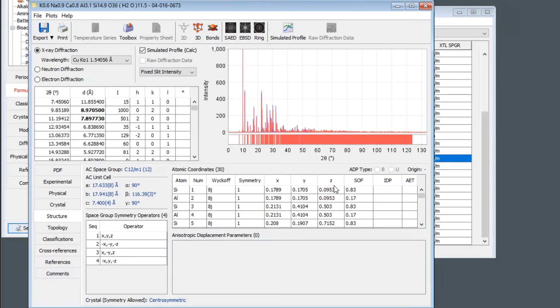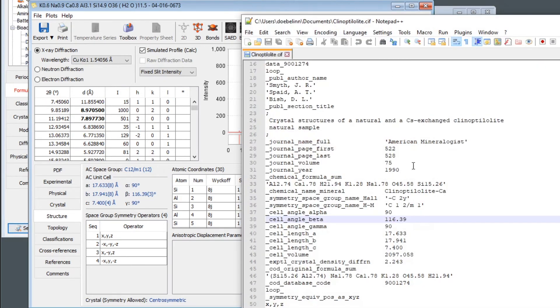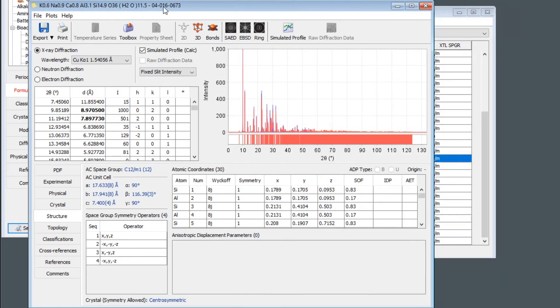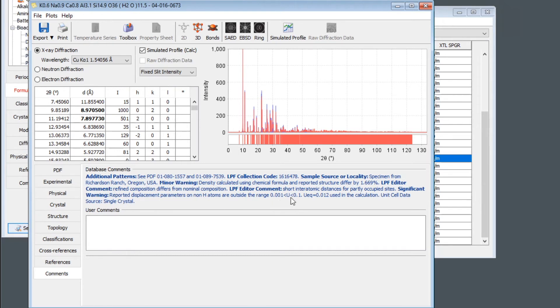It has structural information. So if we go to the structure page, we see the coordinates. But it does not have any isotropic or anisotropic displacement parameters, which is interesting because the CIF file actually has anisotropic U factors. So why are they not in this PDF4 record? Well, if we go to the comments page, there's a warning. Reported displacement parameters on non-H atoms are outside the range 0.001 to 0.1. So obviously the editor of the PDF4 database decided that these values are not trustworthy and omitted them.